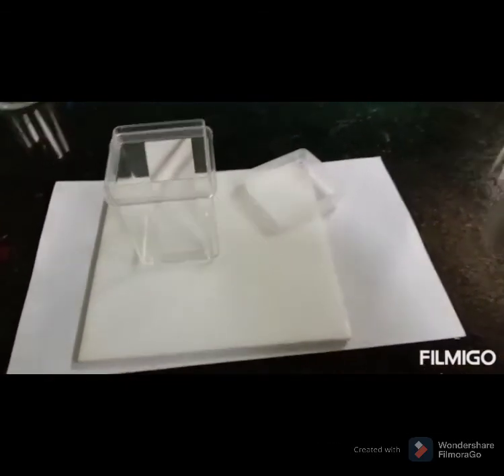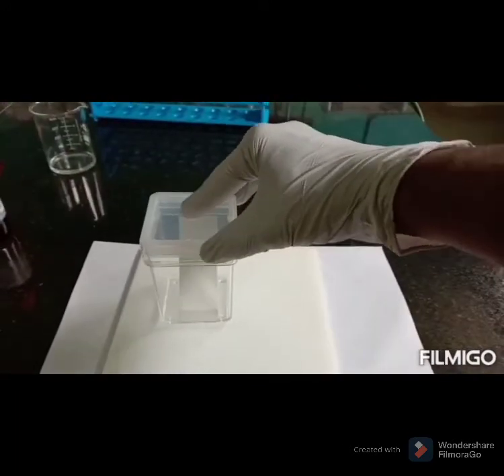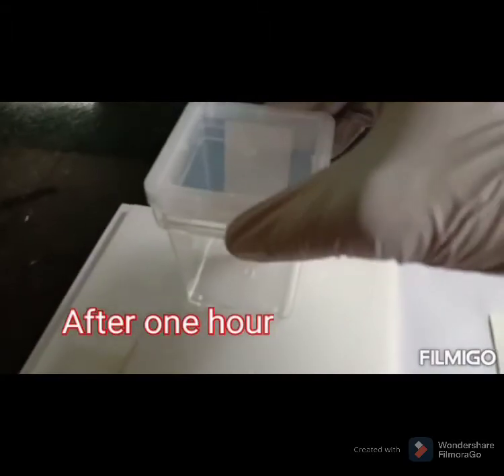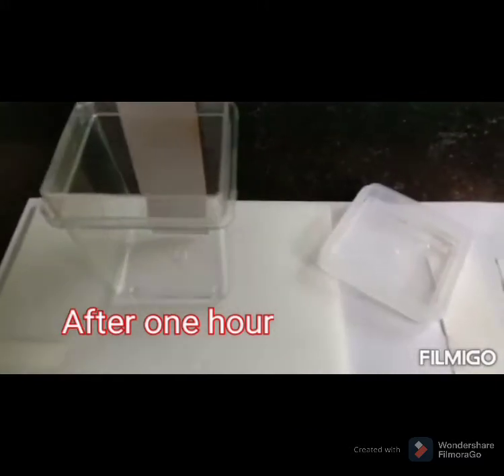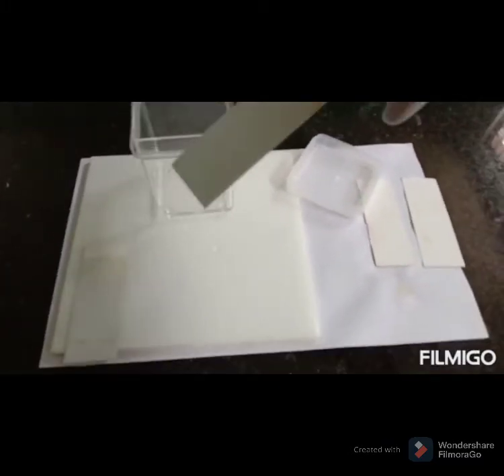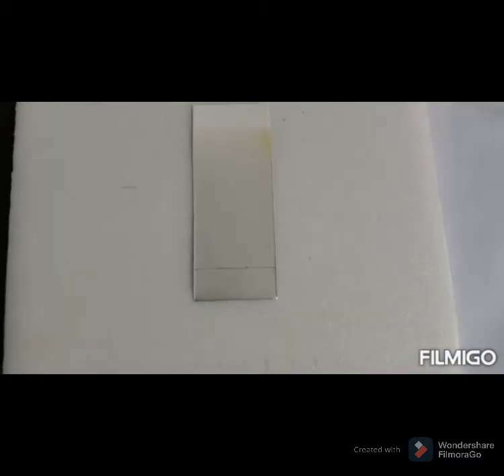The solvent moves up the plate by capillary action, which occurs as a result of the attraction of the solvent molecules to the plate. As the solvent rises through the plate, it meets and dissolves the sample mixture, which then travels up the plate with the solvent at different rates due to differences in affinities. Approximately after 1 hour, when the solvent front reaches 2 centimeters away from the top, you can take the plate out and mark the solvent front with a pencil.